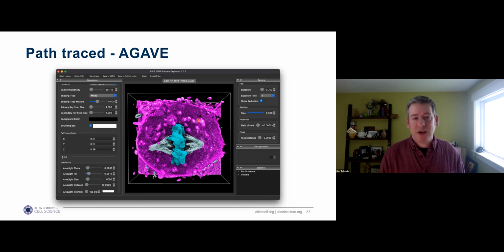So in this particular case, you can see this magenta colored channel has these brighter, shinier reflection highlights compared to the other two colored data channels. The thing to note here is that you can get a very good sense of spatial relationships from the well-defined shadow and lighting cues. Even the reflective highlights are indicative of the shapes that we're seeing, and there's less of a need to tumble or rotate this view to know what's going on. But you can still do that, of course, in the viewer.